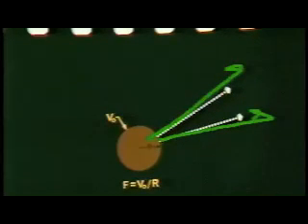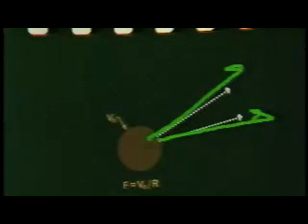And we know that if we intercept at some distance from the sphere those particles with a detector, we'll get magnification. Those charged particles will follow electrostatic field lines that diverge radially into space. And so the magnification that you would get with such a device would simply depend upon how far you are away from the surface of the sphere.